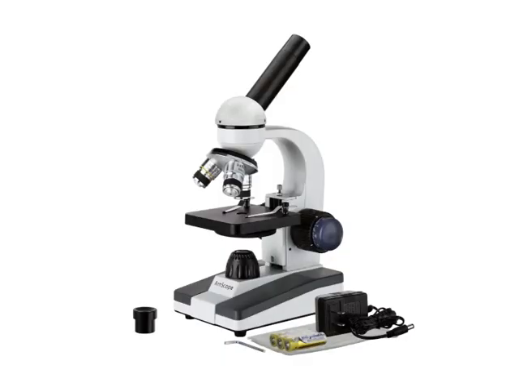Let us come to the first topic, that is the Introduction to Microscopy. A microscope is well defined as an optical apparatus that uses an arrangement of lenses to yield a magnified image of small objects. To achieve this, a microscope uses a number of mechanisms that gather light and then transmit the light track so that a magnified image of the observed object can be focused within a very short distance. The discipline of examining small things using such an instrument is called microscopy. Microscopic means undetectable to the naked eye if not assisted by a microscope.